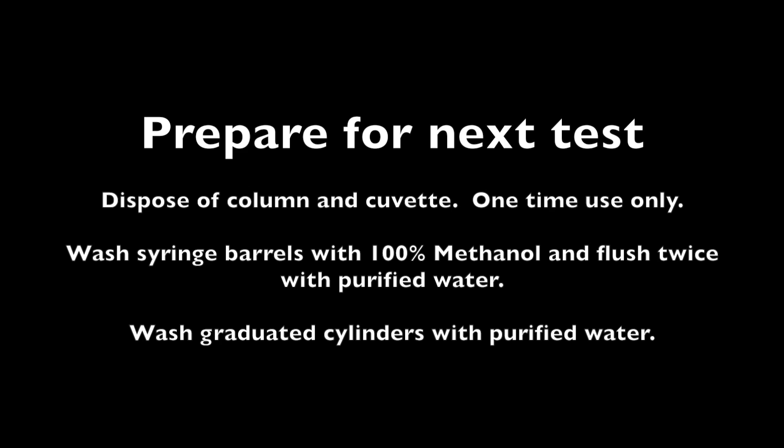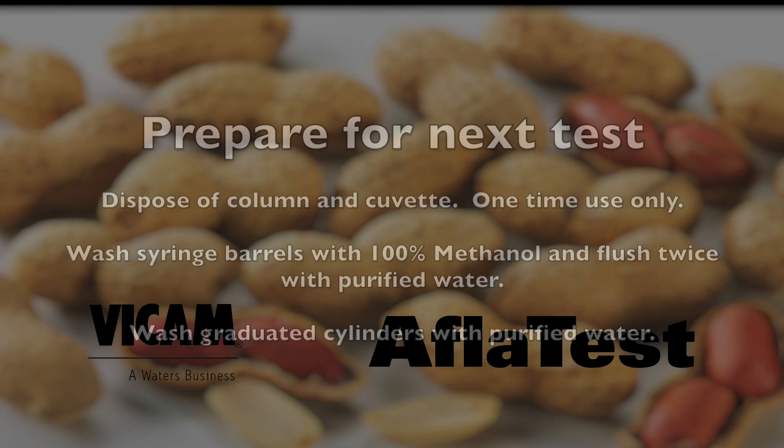Prepare for your next test. Dispose of the column and cuvette — they are good for one-time use only. Wash the syringe barrels with 100% methanol and flush at least twice with purified water. Clean your graduated cylinders with purified water.